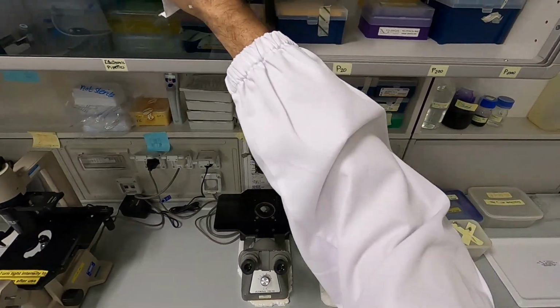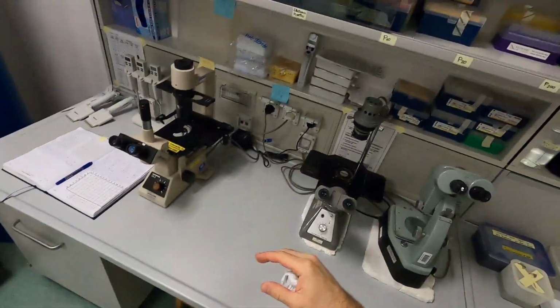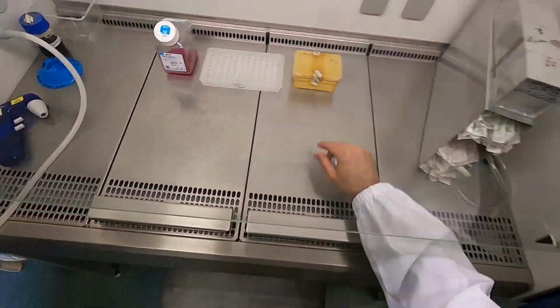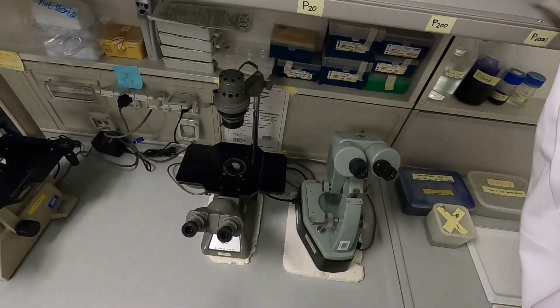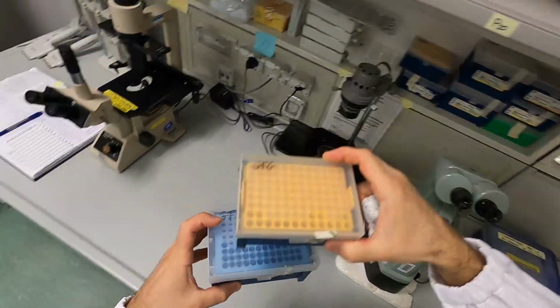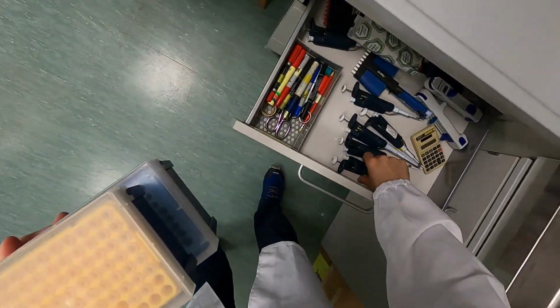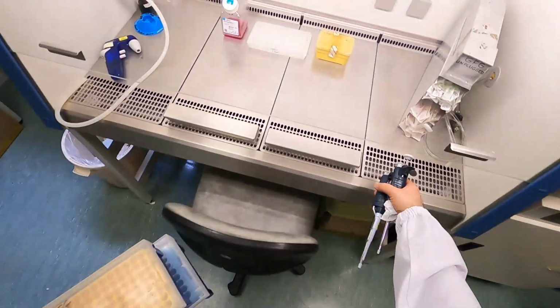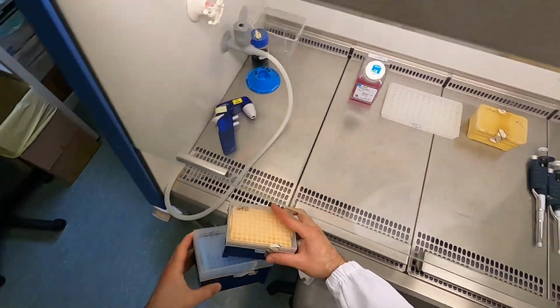The Eppendorf tubes are in this yellow box. And we need a pipette, so we need tips, the P1000 and the P20 or P200 tips. So we get the appropriate pipette, Gilson pipettes from the drawer. Organize it a little bit. A pen.